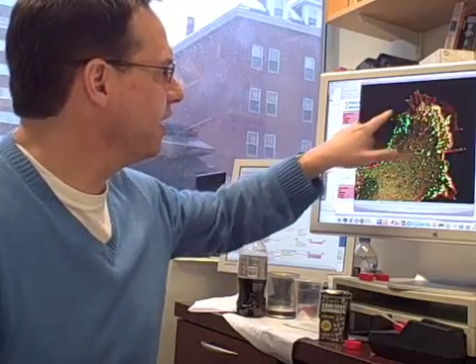And finally, you can see these little rod-like protrusions. Those are called filopodia, and those are built also of actin, but the actin is organized differently — it's all bundled up into a rod-like structure. You can see the MENA is concentrated right at the tips of filopodia as they extend and explore their environment.